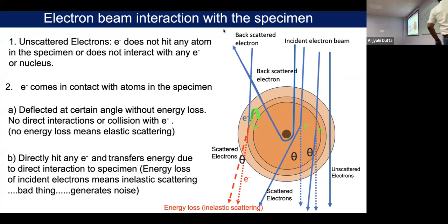So if we think about why: we are talking about electron energy, and we are considering all the electrons to be coherent, all coming in with the same energy and giving us an image, because we are using a magnetic lens. Its power is the same. We cannot change the power. When the electron is not losing any energy, they will come and converge somewhere here.